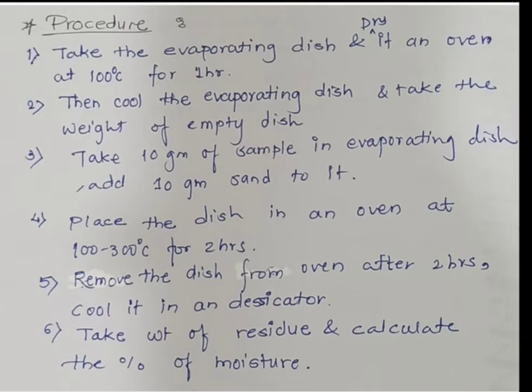After that, cool the evaporating dish and take the weight of the empty dish, which should be dried.